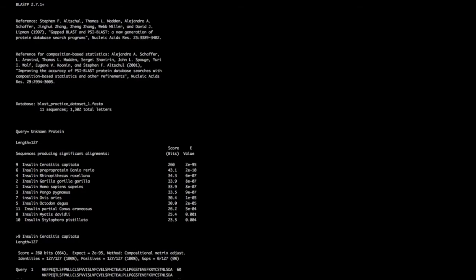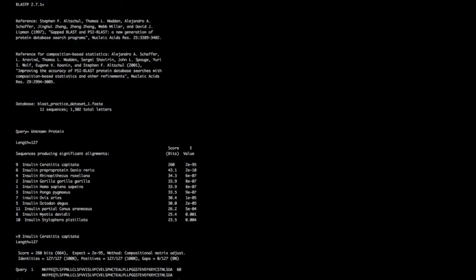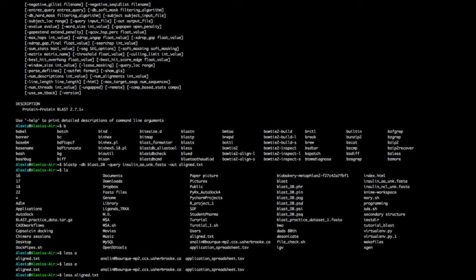Now let's do something similar with the nucleotide sequence. Press Q to leave the viewer. We're going to send a query to the NIH server and BLAST it against everything we know — so now we'll do a BLASTN. Our query will be the insulin nucleotide unknown file, and our database will be 'nt', the nucleotide database.